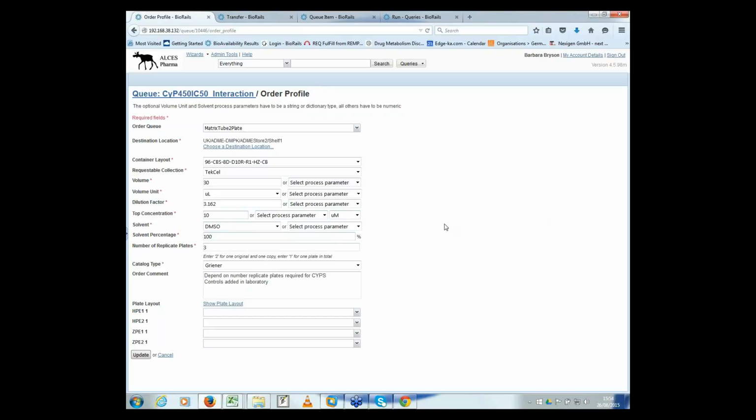And then the next question, can the inventory system track the same lot in two different locations, i.e. solid at a CRO and solid in-house from the same synthesis? Yep, so the lot is still a conceptual thing. It's a lot of manufacture, and it's realized as a number of different samples that are in containers. So you can have the same lot in multiple containers that can be in different locations. I think that's the question. Yes, whether it can track the same lot and batch at different locations. Yep, you can certainly do that.